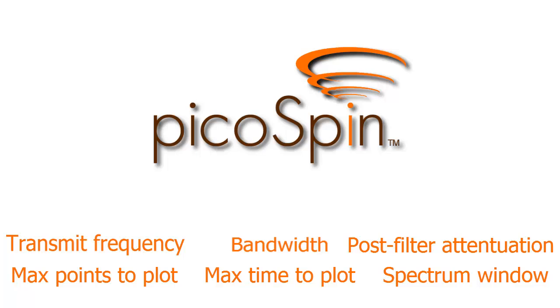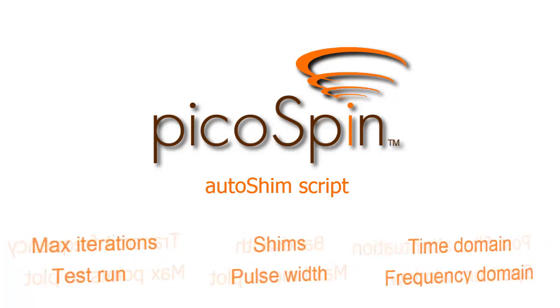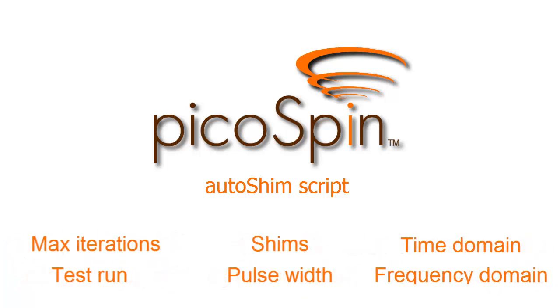In this video, we'll also explore the topic of shimming using the AutoShim script. We'll describe various parameters, their meaning and optimum values for shimming, and we'll examine the text displayed in the scrolling text window, as well as the time and frequency domain plots.